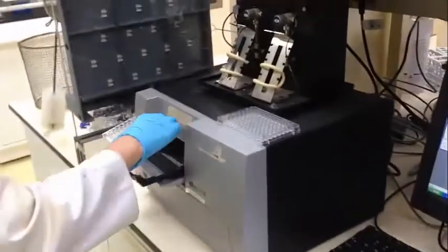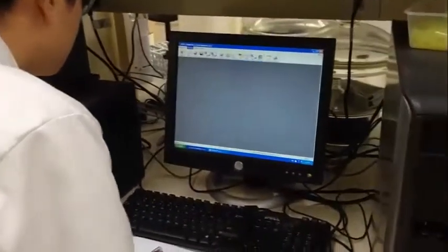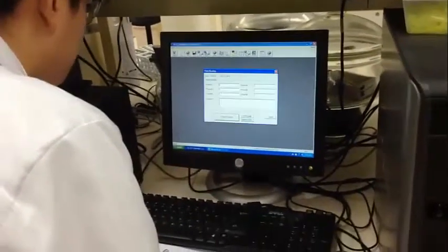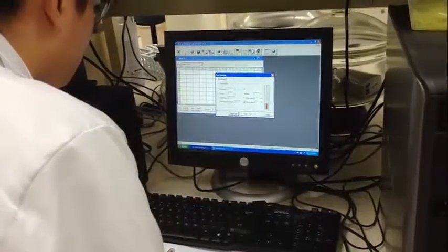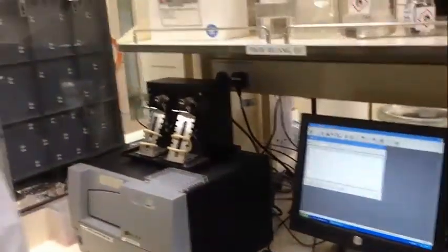After that, we let the mixtures interact at 37 degrees Celsius for 2 hours. See you back in 2 hours.